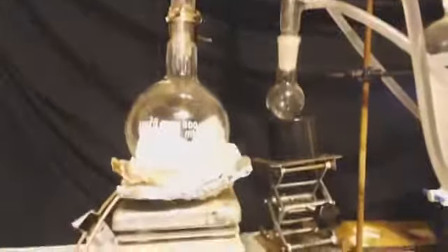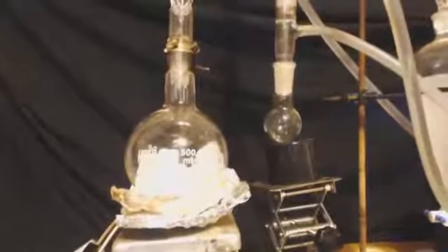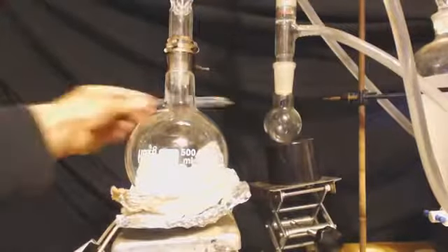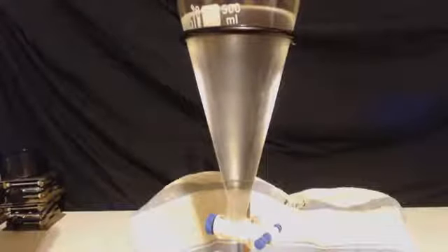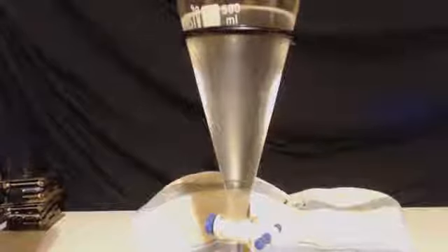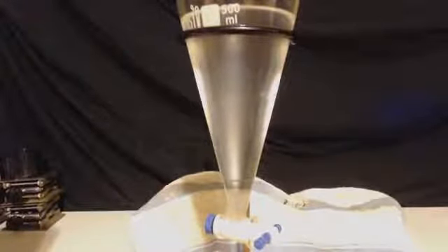The first couple milliliters I tossed out, or put aside rather, and then pretty much all of it came over from 109 degrees Celsius to 112 degrees Celsius, and then it shot up to 120 after that.